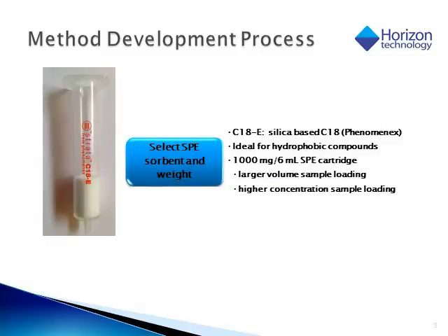When selecting the SPE sorbent and weight, I recall the chemical structure and solubility of my compounds, and I had a nonpolar, a semipolar, and a polar compound to consider. A C18 based silica sorbent will really work best for me for this particular situation, just because it has the ideal nature of maintaining the hydrophobic compounds and allowing the others to elute from the packing or sorbent material.